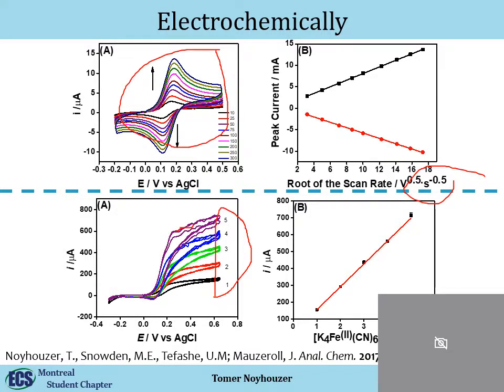And that's because we had an issue with the pump. I told you, you have to make sure the pump doesn't add noise to your measurement. In this case, the Faraday cage of the pump was not sealed well enough, so it added some noise to our measurement. But you can still see that the error bars in 5, that looks really bad, they're not that bad, actually. It still gives you a linear behavior, and those are small fluctuations. It just doesn't look really well.